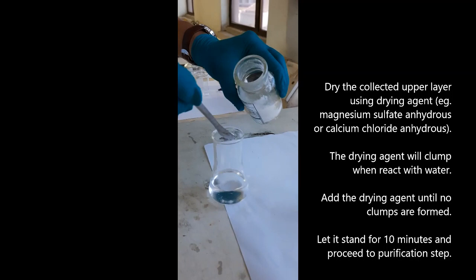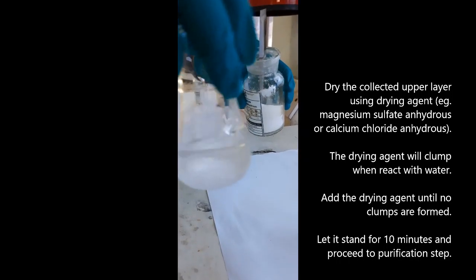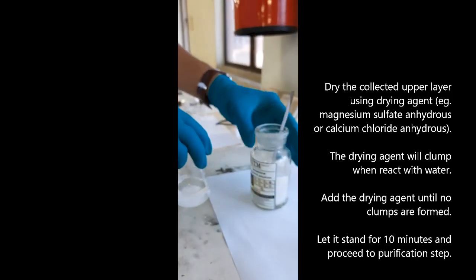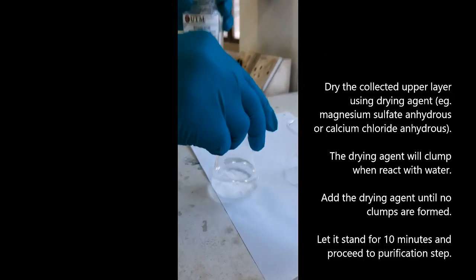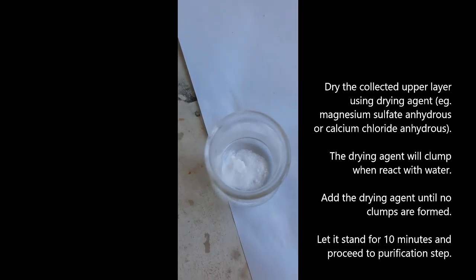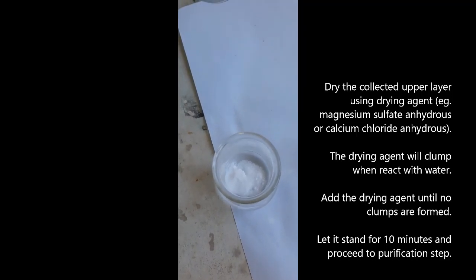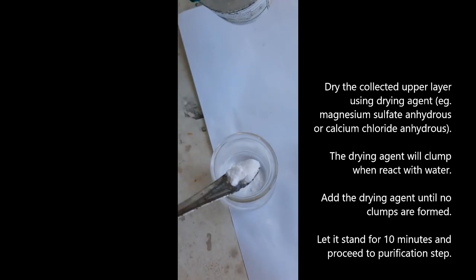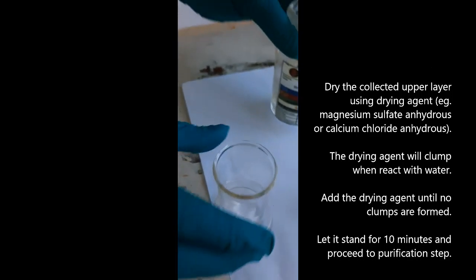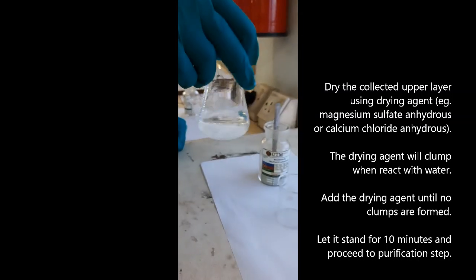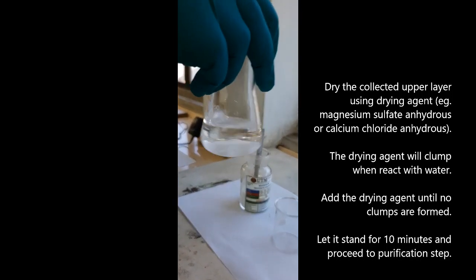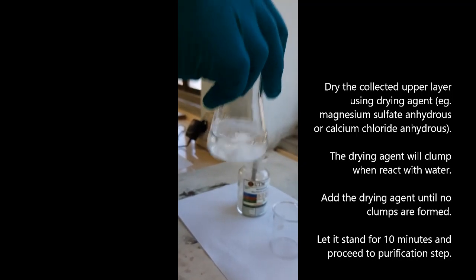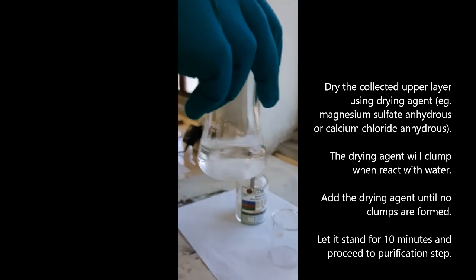Dry the collected upper organic layer over a drying agent. This can either be anhydrous magnesium sulfate or calcium chloride. Observe when the drying agent comes into contact with the liquid product. Surplus water causes the drying agent to clump. Add more drying agent until clumps are no longer visible. Let it stand for 10 minutes before proceeding to the purification step.